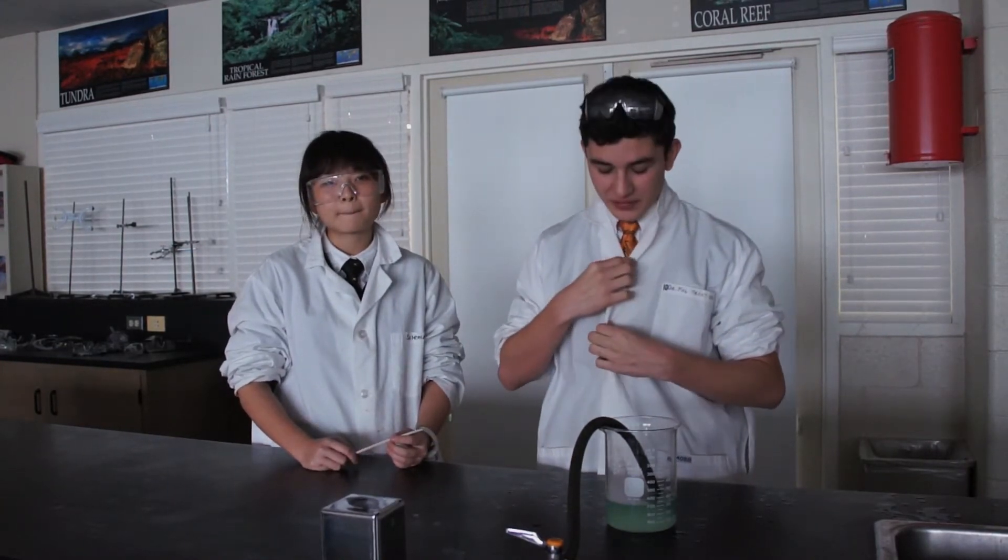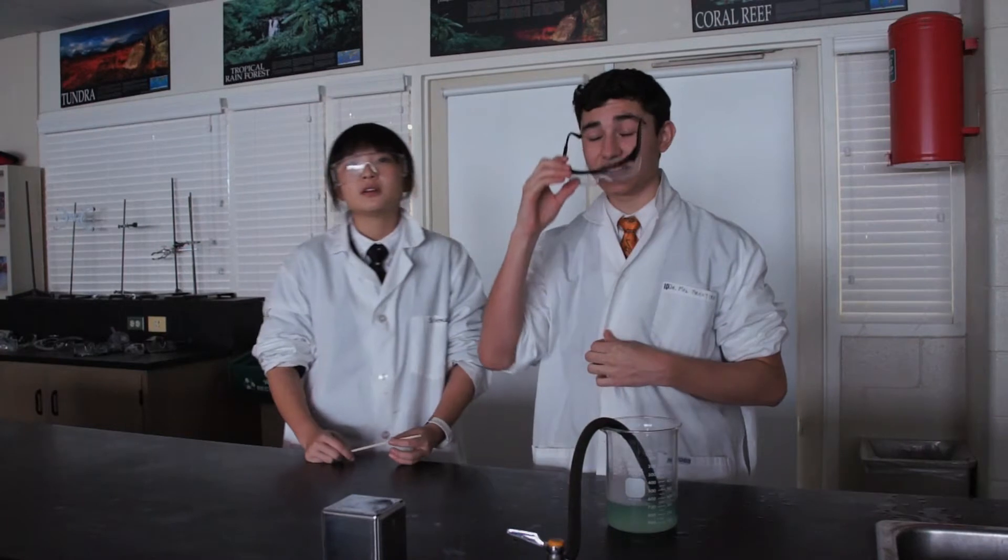And we're going to do our safety first. So first off we need to have our lab coats and our glasses. And girls, remember to tie your hair up and put your sleeves up, okay? Yes.